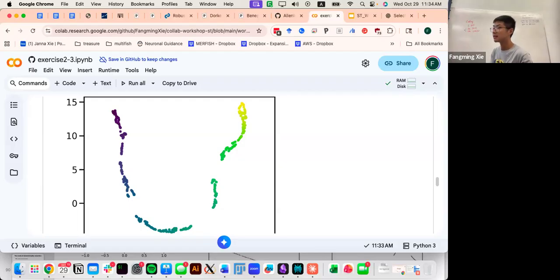Can I just show you? So I applied the PCA, I don't know if this is correct, and if this can be used. Yeah, I think so. It ran through, yeah, it did. I just don't know if it makes sense. And then if I did that, what about these ones? How could I fill these?